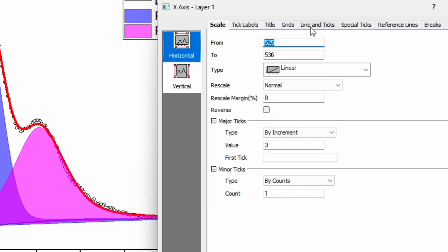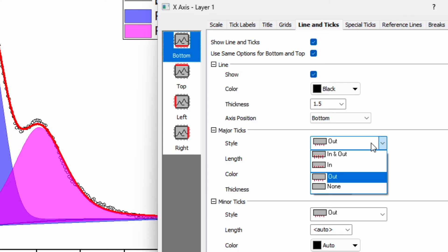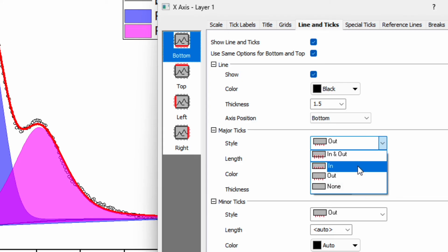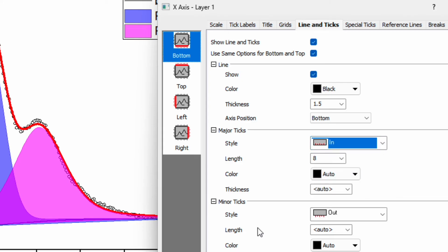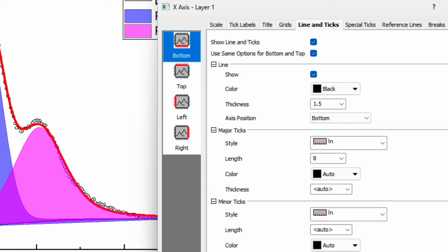Now go to the line and ticks. Here you will see option: use same option for both top and bottom, so check this box. Now major ticks, if you click on this option then you will see there are 4 different options. I usually prefer inward. Similarly for the minor ticks, inward, and apply.